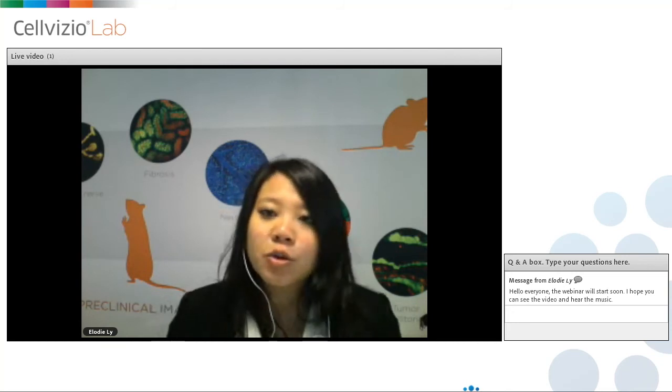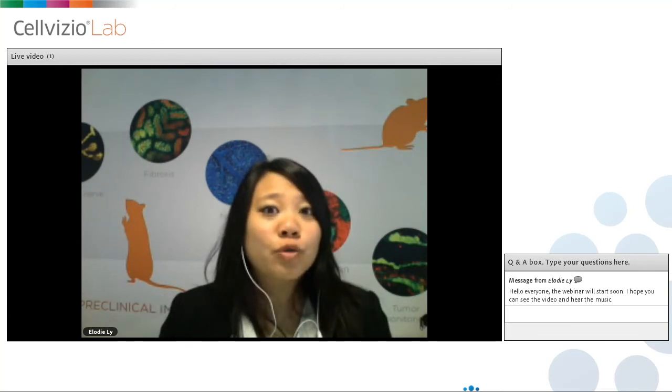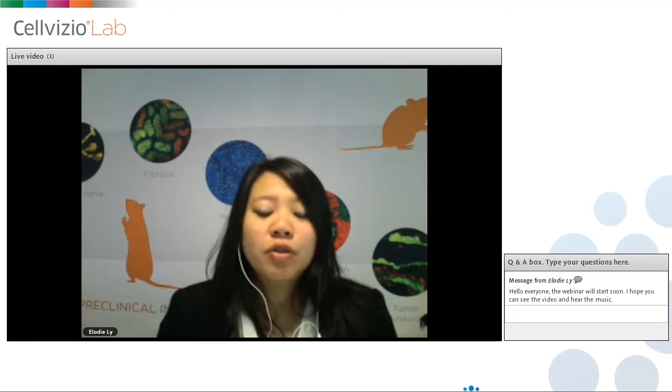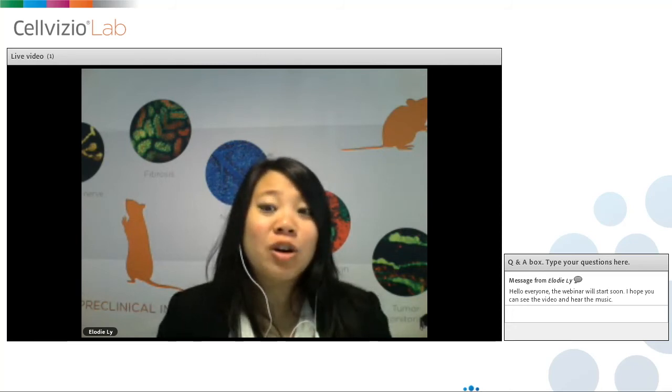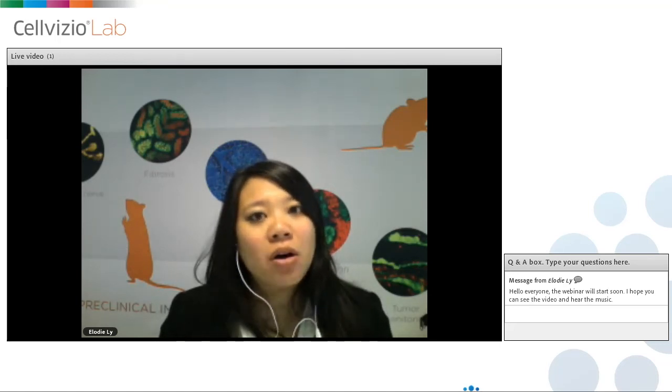I have another question regarding endovascular imaging. Endovascular imaging means being able to insert our confocal probe inside the vessel. Of course, the larger the animal, the easier the procedure. For example, if you want to work on the mouse, endovascular access would be difficult because the vessels are very small.